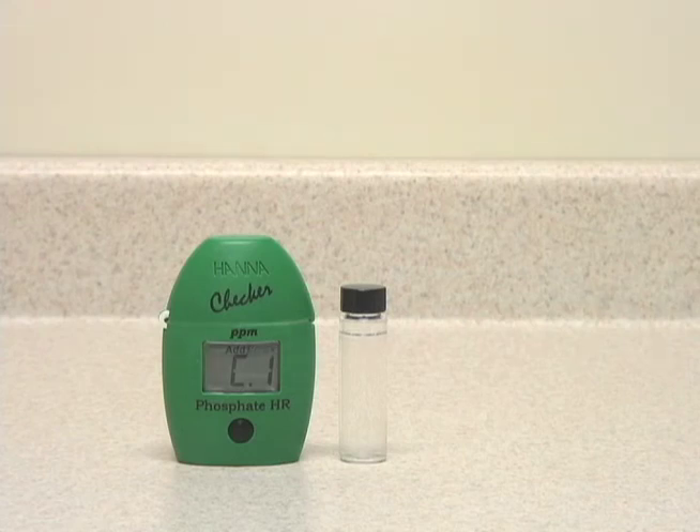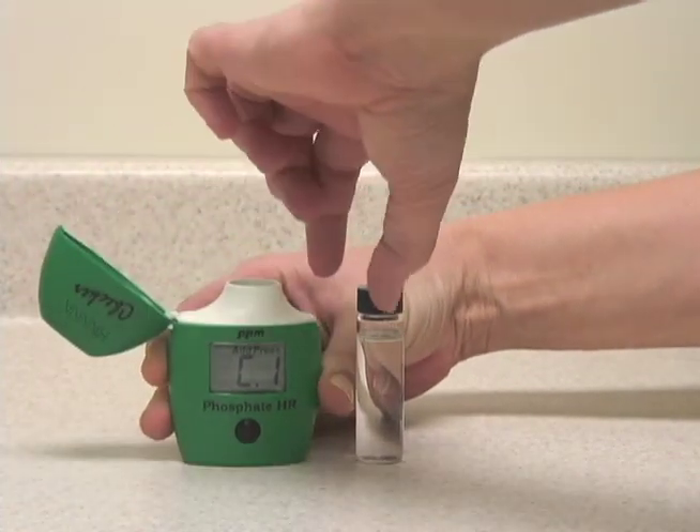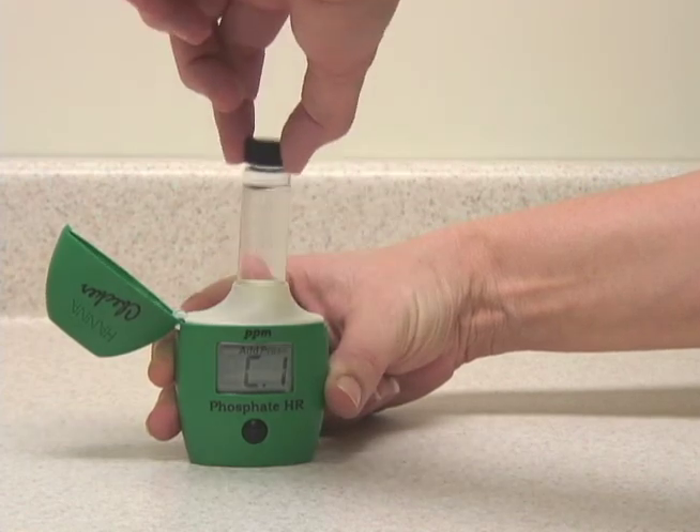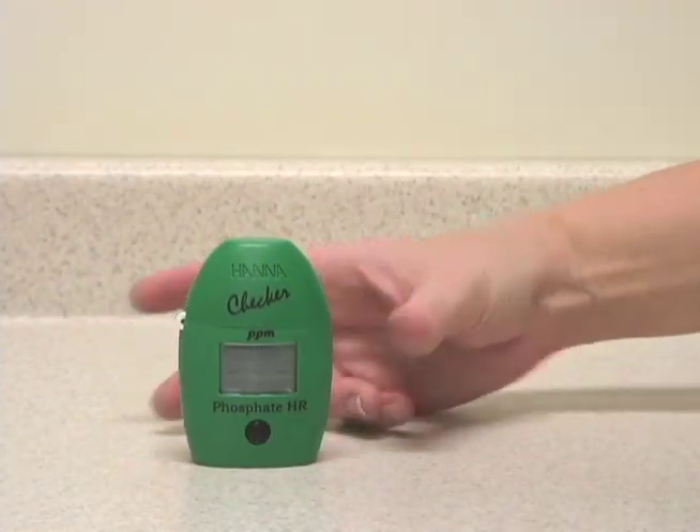Today, we're going to test a sample of seawater with the HI717 high-range phosphate checker. To run the test, the first thing we'll do is take the sample of unreacted seawater, put it in the checker, and press the button once to zero it.